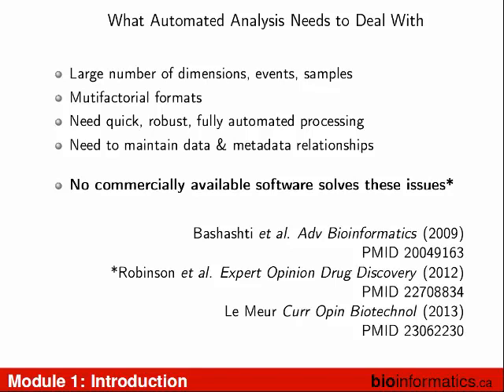Because all of a sudden, it's like normal underscore something, something, something. And then somebody says disease dash something. And you have to spend all this time, and we have better things to do. So be consistent in how you do naming, be consistent in your column names, be consistent in your labeling of reagents, what you put in the FCS file. Pick something and stick with it. And if you change it, then go back and change it for all the other files.